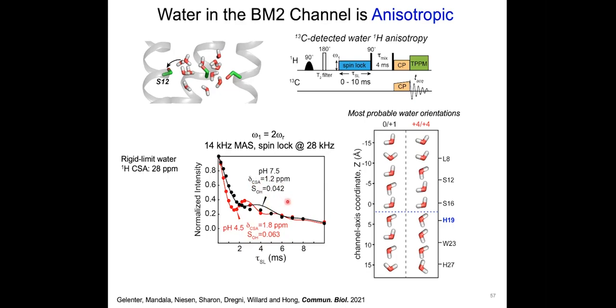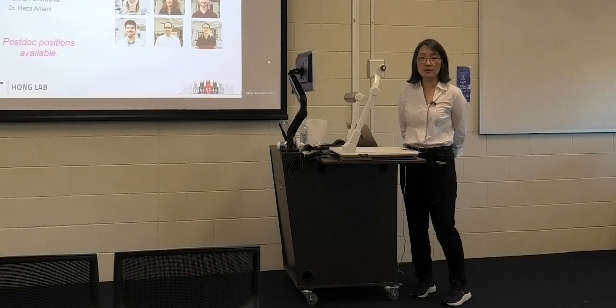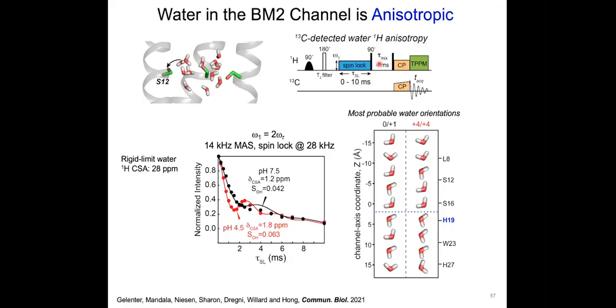Okay, so this is another interesting take of the water additive where you do something more special with spin lock. So it's not just the amount of water, but it's also the dynamics. You can imagine that this can be extended to a lot of systems. Okay, forgot to mention that you might say, why do so many transfers? Why not just do it on the proton side and then detect? Why go through the trouble of transferring to the protein?